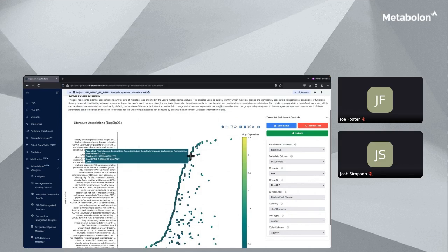Unlike the ANCOM volcano plot, which highlights individual taxa that differ significantly between the groups, this tool identifies collections of taxa that collectively exhibit meaningful shifts across your cohort, which offers a deeper and different biological context. In the case of our current dataset, you can see that one of the top associations is with the set of microbes that are elevated in Crohn's disease relative to healthy individuals, which makes sense given the context of our IBD study. As you see, these results can reveal broader functional themes in the data, which moves us from taxonomic changes to metabolic and physiological interpretations.